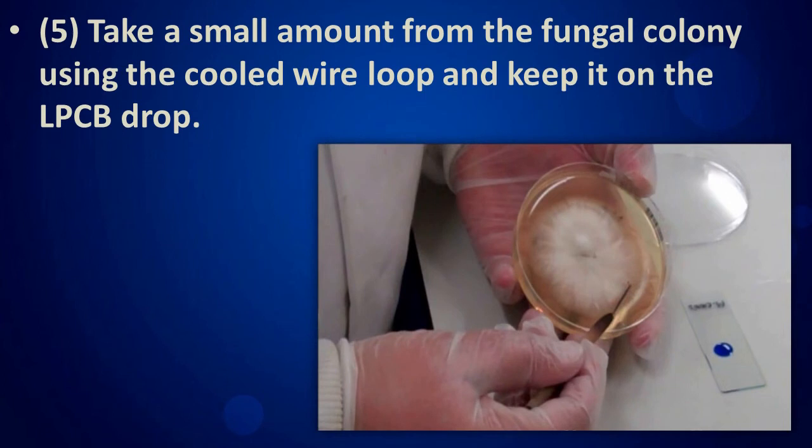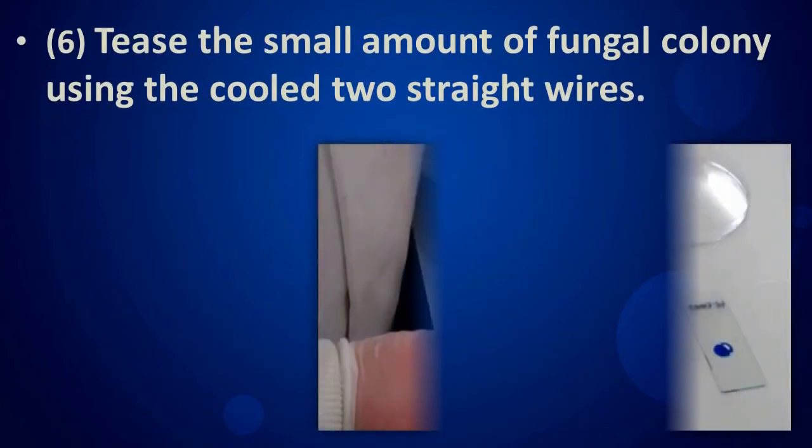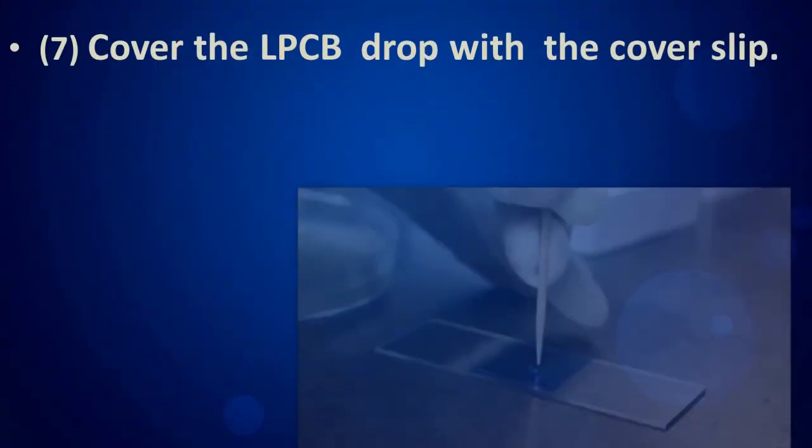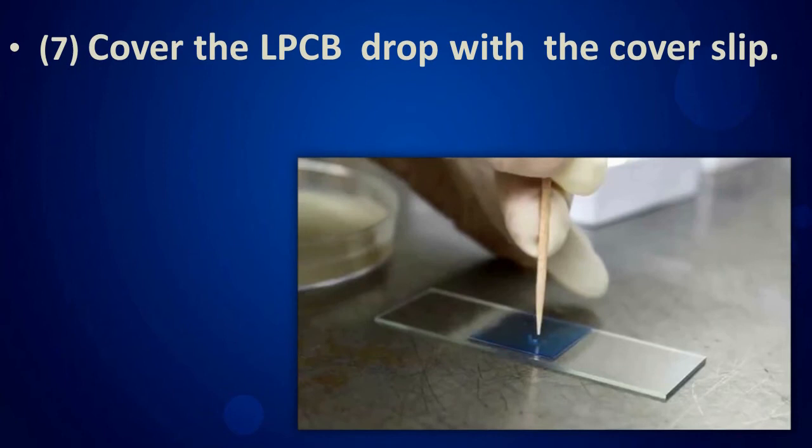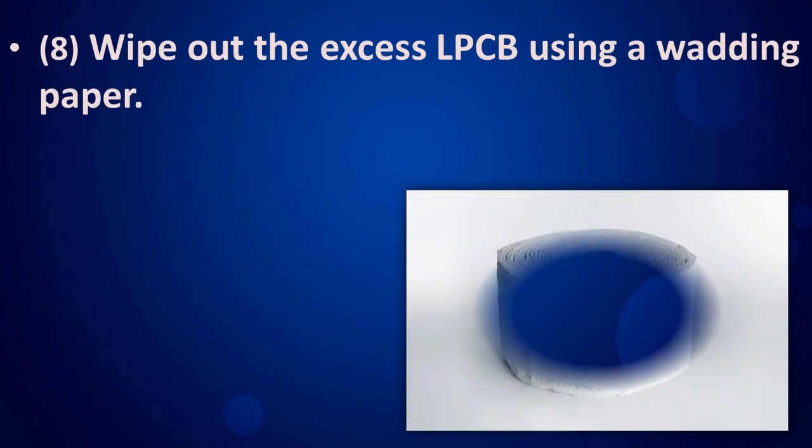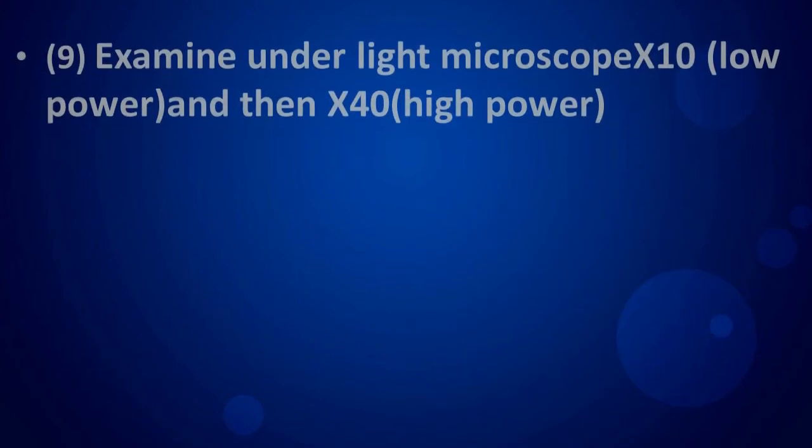blue drop. Tease the small amount of fungal colony using the cooled two straight wires. Cover the lactophenol cotton blue drop with the cover slip. Wipe out the excess lactophenol cotton blue using a wadding paper. Examine under light microscope.